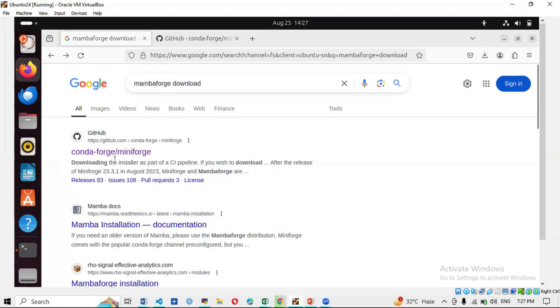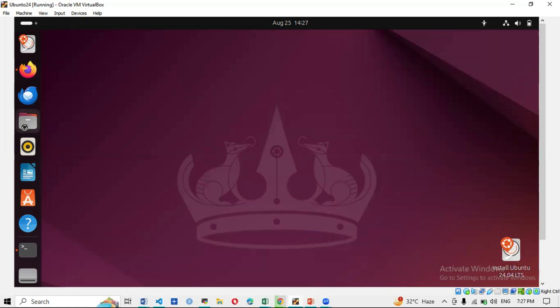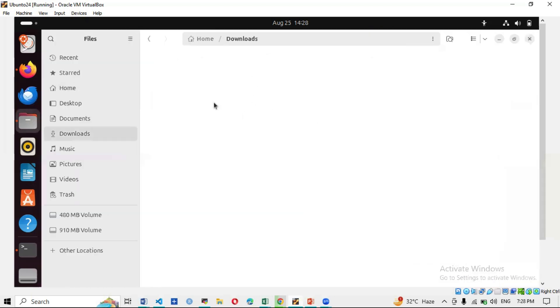Go to Google and search 'Mambaforge download' — this will bring up the GitHub page for conda Miniforge. Click on it and download the first link: Miniforge3-Linux-x86_64. Just click it and the download will start. The downloaded file is a .sh (shell) file — it contains the script used to install Mambaforge/Miniforge.